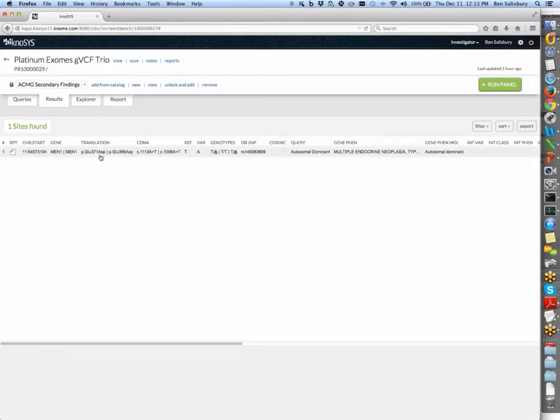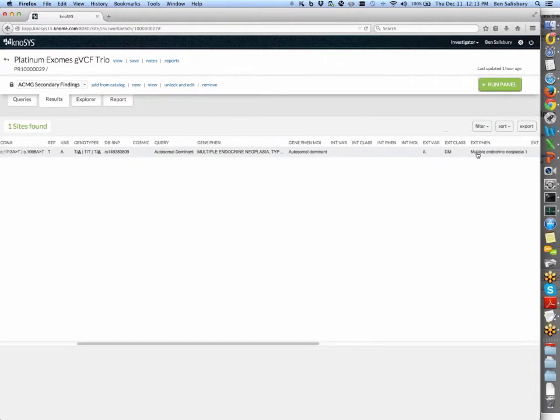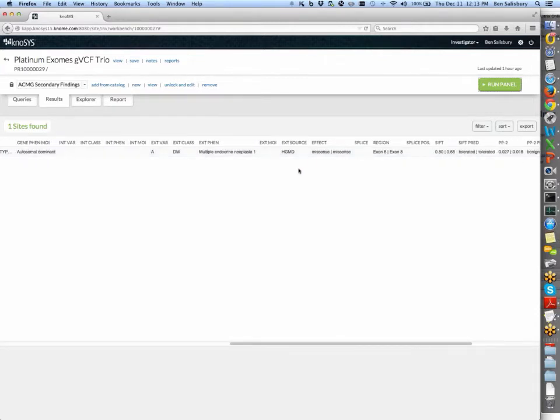And so we can see this variant with a couple different codon positions depending on the transcript being interrogated for the gene MEN1, which is connected with multiple endocrine neoplasia, which is supposed to be a dominant trait. And if we scroll to the right again, we find that this is a variant observed in the literature. HGMD has a record of it with that disease, and they labeled it as a disease-causing mutation.